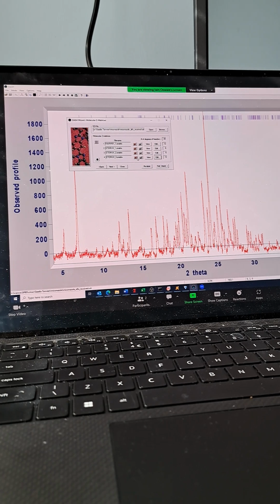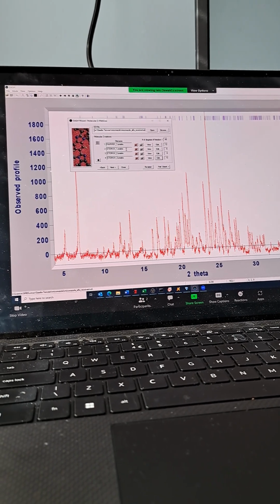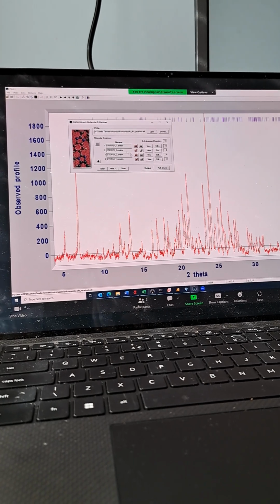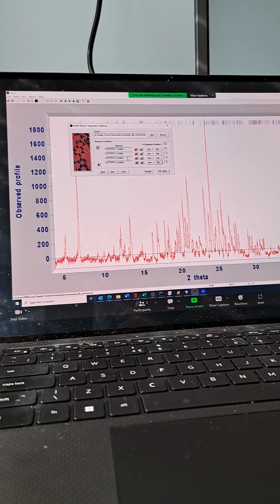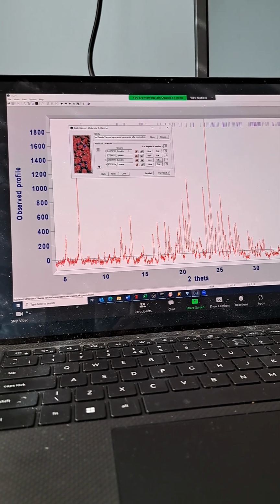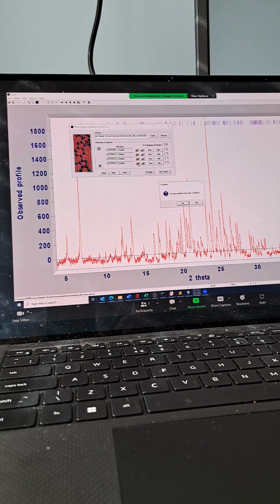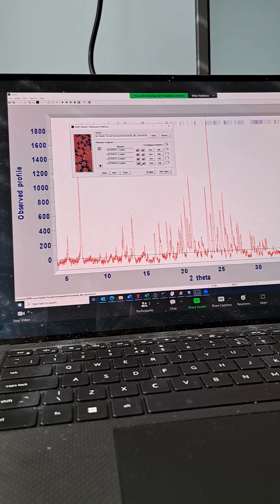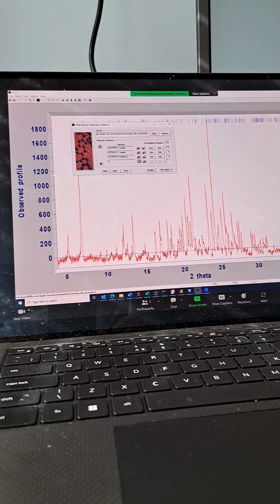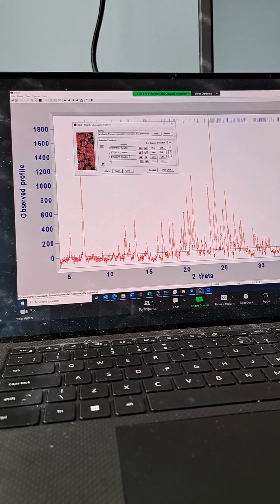If, for example, this was a hydrate, not a nitrate, say it was a hydrate that we put in here, then it will show the water. So I have water in here, and it will have the miconazole. We don't want 2 miconazoles in here, we only want 1. So I'm going to delete that last one. I'm going to delete that one. I don't want that either. And how many waters do I want? Well, I might want 2. Therefore, I've got 1 water molecule and 2 water molecules.